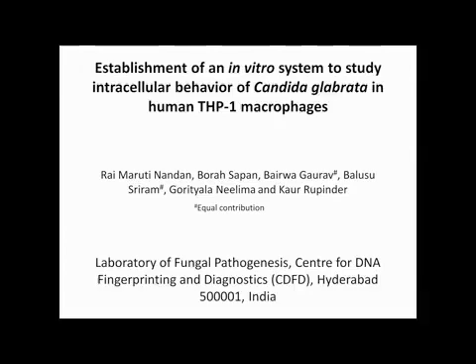The overall goal of this procedure is to establish an in vitro culture model system to study the intracellular behavior of a human opportunistic fungal pathogen, Candida glabrata, in macrophages derived from the human monocytic cell line THP1.